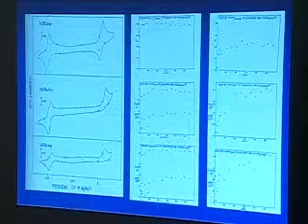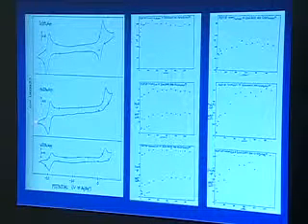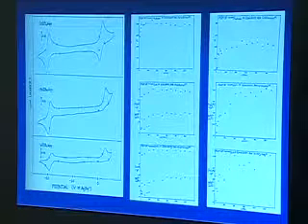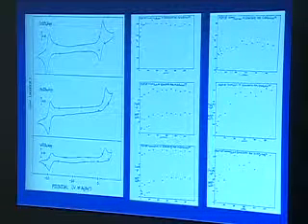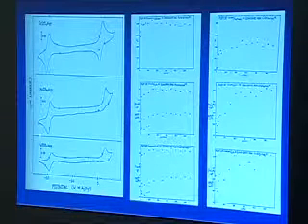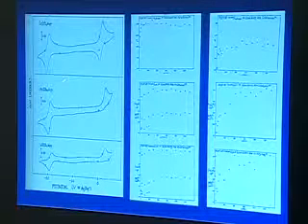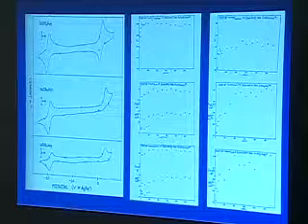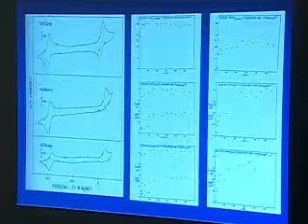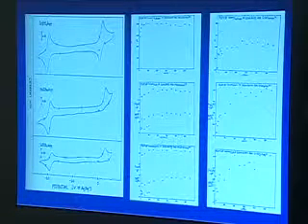If I scan sufficiently slow, then between when I do this reduction here and come back and do the oxidation, I've lost the CO, and so I can't put the electron back into it. And so I predict that this peak, as I increase the scan rate, will increase linearly with scan rate to the 1/2 power, but this peak is going to fall off because I'm missing some of the molecules as I do that. And the faster I scan, though, this will be less of an impact because I can beat out that process.